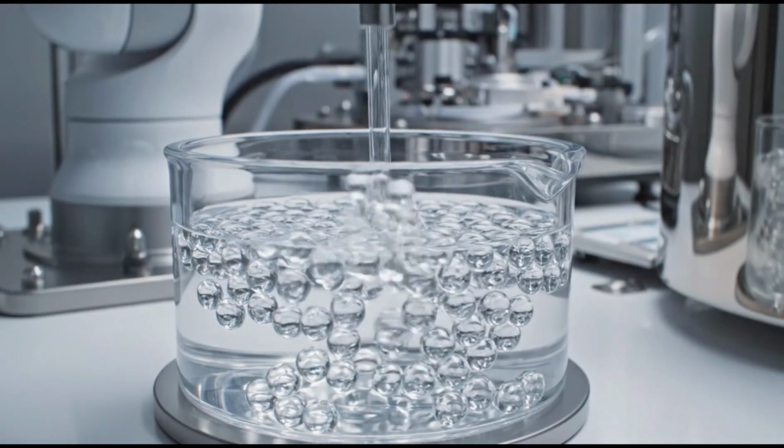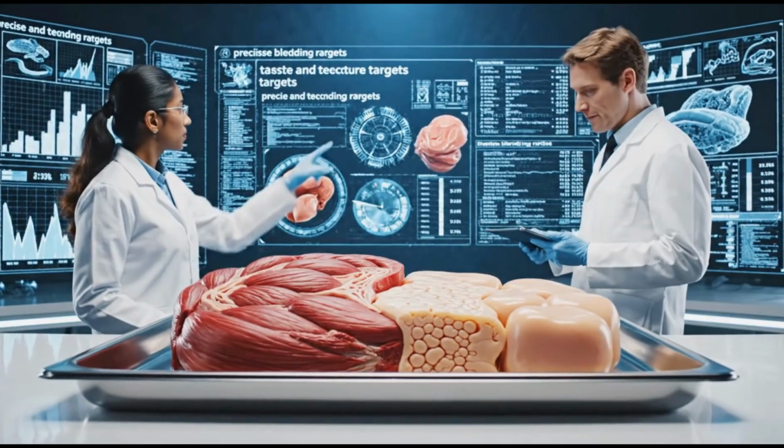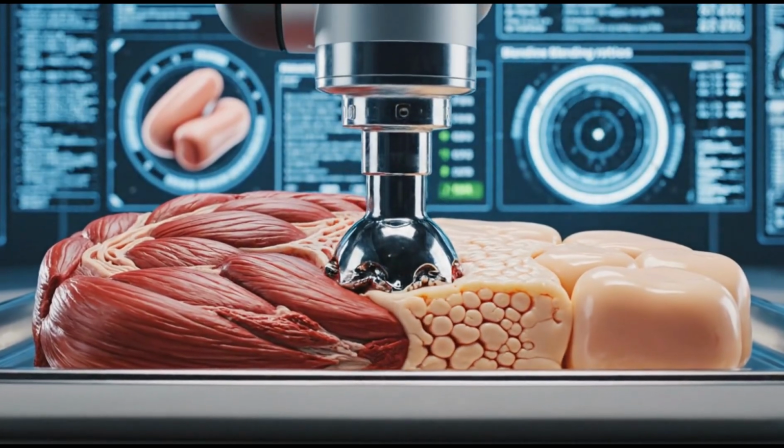Fat cells harvested at peak quality stage. Automated systems extract cells gently. No damage visible during removal. Digital systems calculate precise blending ratios. Technicians confirm taste and texture targets. Scene introduces controlled combination.